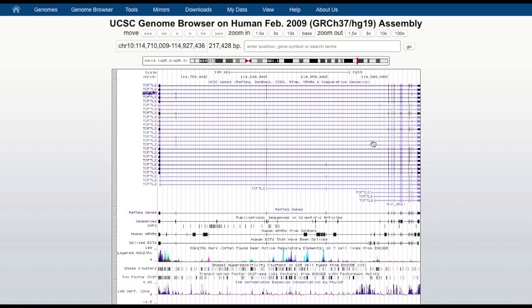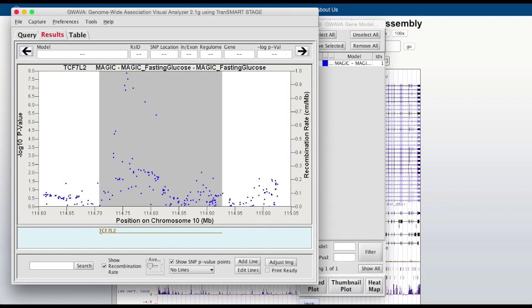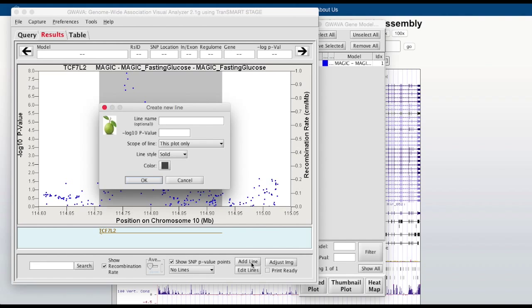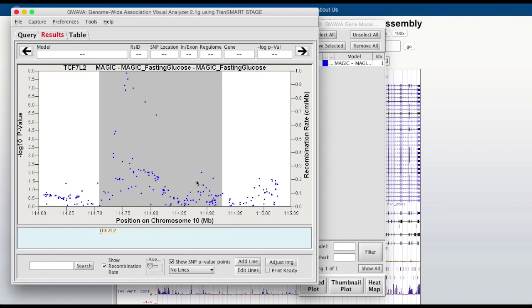Right-clicking on a gene, for example TCF7L2, will automatically display the UCSC genome browser for further investigation. Lines of significance can be added and updated, and the image can be adjusted in order to be print ready.